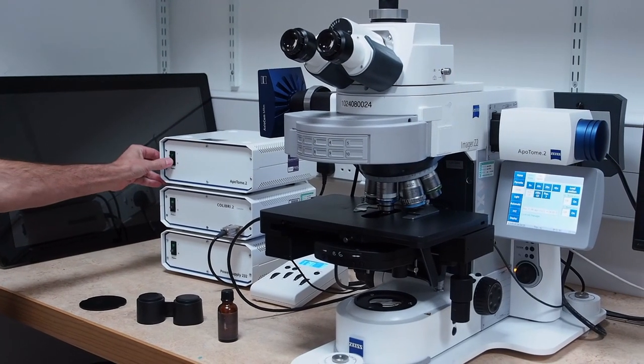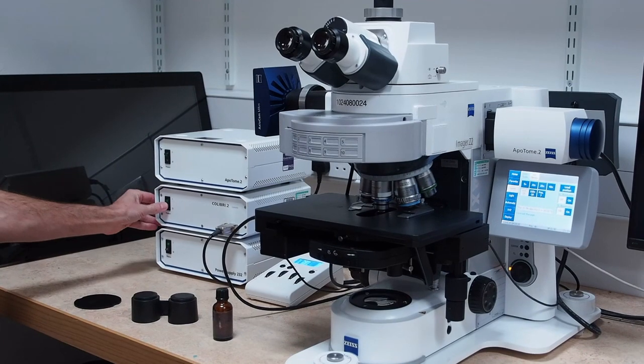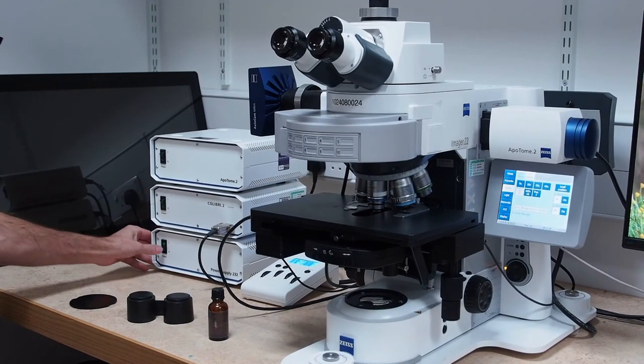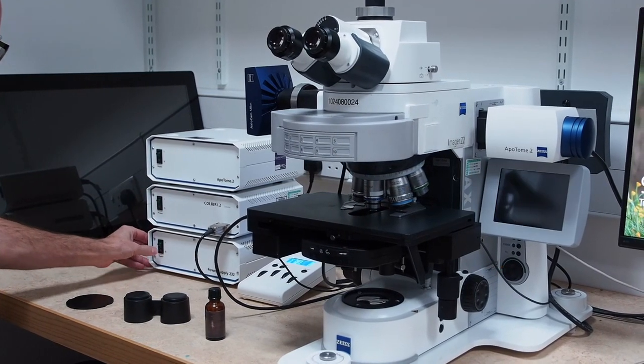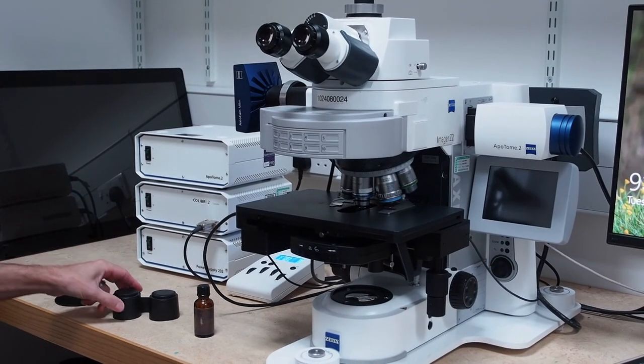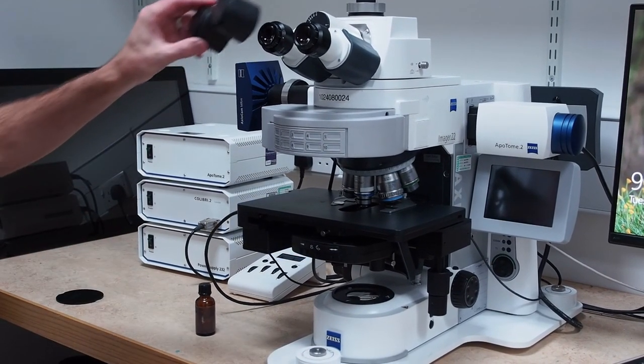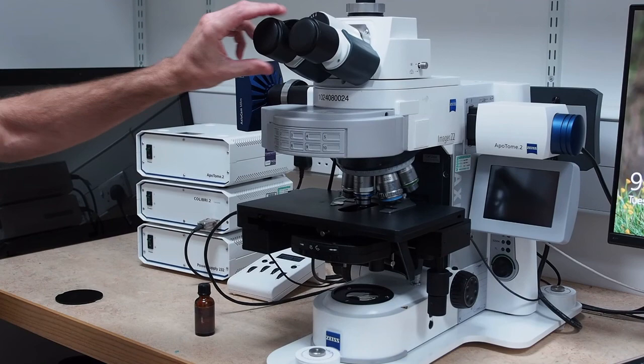For Axio Imager 1, power off the three boxes on the right hand side of the microscope and finally replace the ocular cap and the anti-reflection cover for the transmission arm. For Axio Imager 2, power off the three boxes on the left hand side of the microscope, then replace the ocular cap and the anti-reflection cover for the transmission arm.